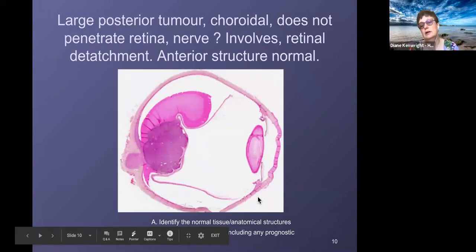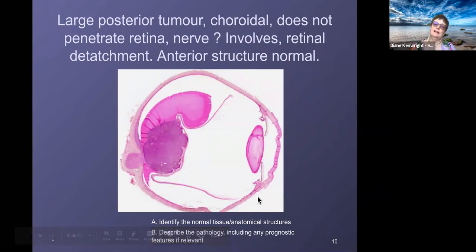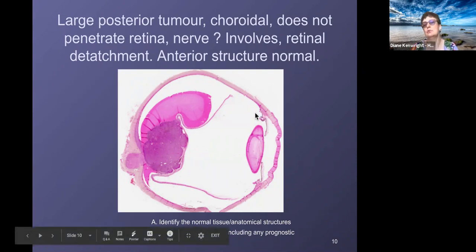Oh gosh, wouldn't it be great if we got a perfect slide out every time? Unfortunately, the slides are really hard to cut. There's a very technical process for producing nice globes that our lab uses, a mixture of wax impregnation involving beeswax and ordinary histological wax to get the right mixture to support the eye.